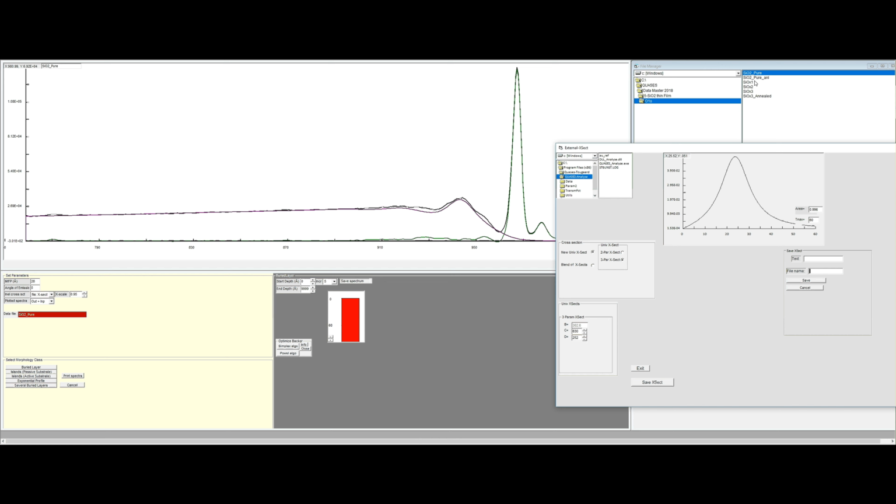If you use this in practice, I've done that for the silicon dioxide islands formed on silicon, you get about the same result to within a few percent. So it's not that critical how you do it. But this shows how you can find a reasonable cross-section for samples where you don't have a cross-section available. Usually you would not need to use this because the cross-sections you have here are usually sufficient. But it's nice to have in some cases.